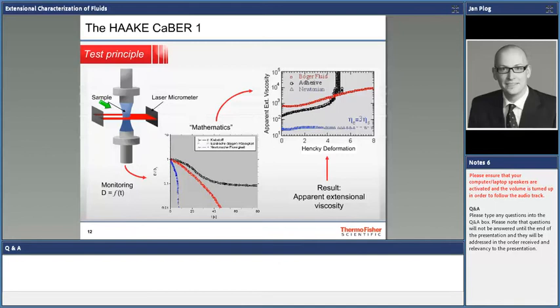So here again in a schematic, what you do is you pull the plates apart after some initial rearrangement of your fluid column by gravitational sag. The driving force of the experiment will be the capillary force, the capillary pressure, and this will squeeze this filament together.